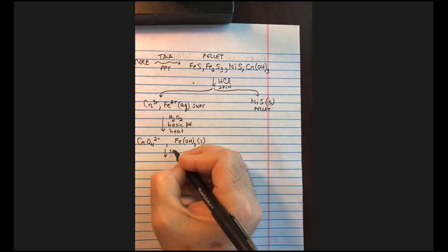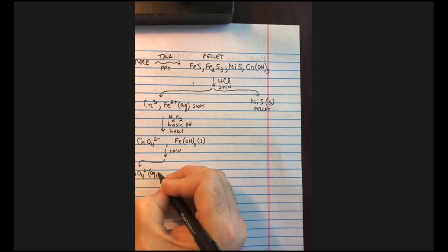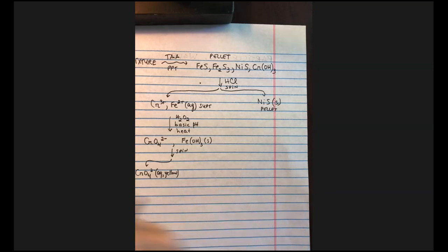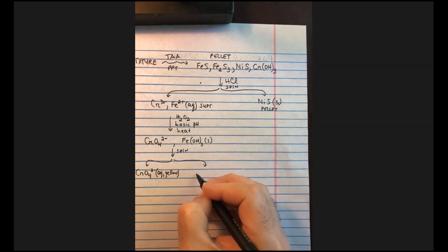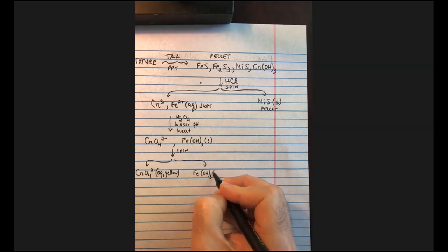So if we spin this mixture, we're going to be able to separate the soluble chromate ions. And you remember that chromate is going to give you kind of like a yellow solution. How bright it is will depend ultimately on how much of it there is, right? And then in your pellet, you're going to have your iron 3 hydroxide solid.